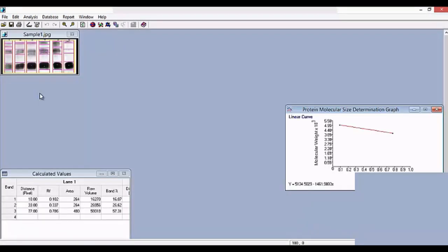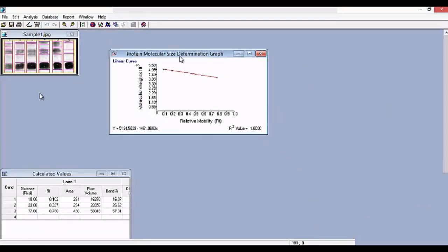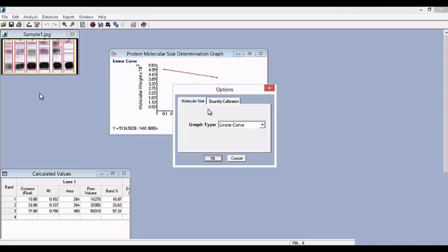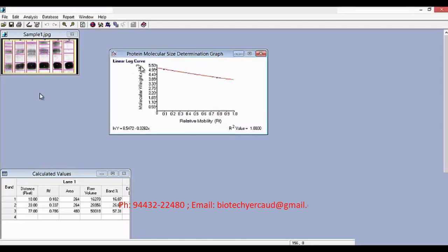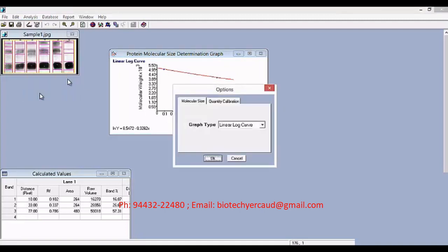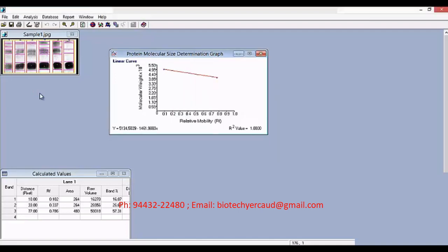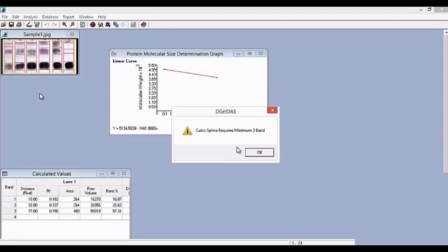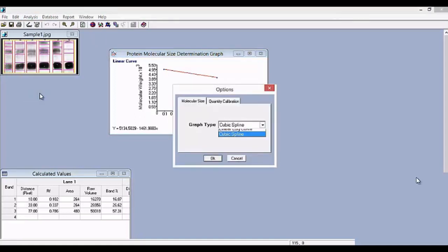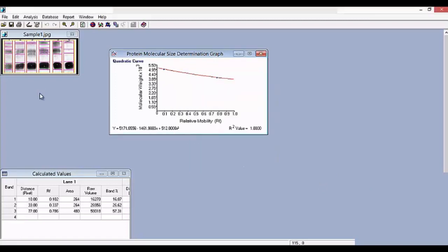Now let's look at the graph. This is the linear curve protein molecular size determination graph. Go to Analysis, then Options to change the type of graph. We can choose linear curve, quadratic curve, linear log curve, or cubic spline curve. The default is linear curve. We can see the linear log curve result. Go back to Analysis, Options, and choose linear curve to see that result. Go back to Analysis, Options and change the graph type to cubic spline. Cubic spline requires a minimum of 3 bands in the standard lane — since the standard lane here has only 2 bands, we cannot use the cubic spline curve. You can also use the quadratic curve, and this is the result of the quadratic curve.